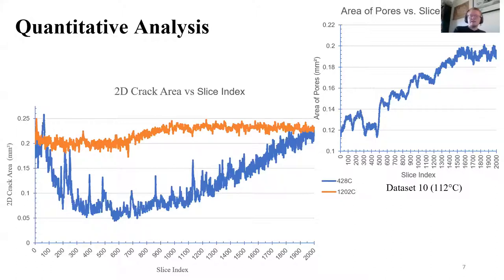If you would imagine an hourglass, this is like a very small area of the hourglass before flaring into a larger cavern or a larger pore. This indicates that during that initial polymer infiltration cycle, either the polymer was too viscous or the fibers orientation or placement got in the way. But it indicates that there was a certain choke point that didn't allow for the polymer to infiltrate properly or completely. We can use this analysis to produce characteristics and to produce a way of maybe even a secondary phase of infiltration that would allow for a more complete and in turn, a tougher sample of CMC.